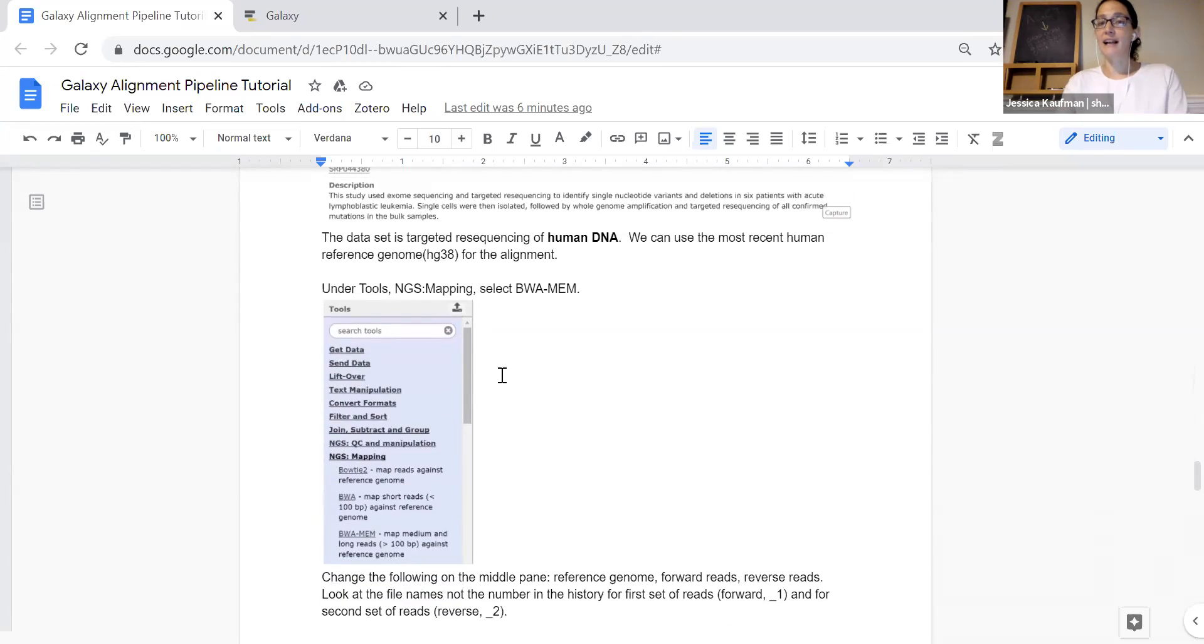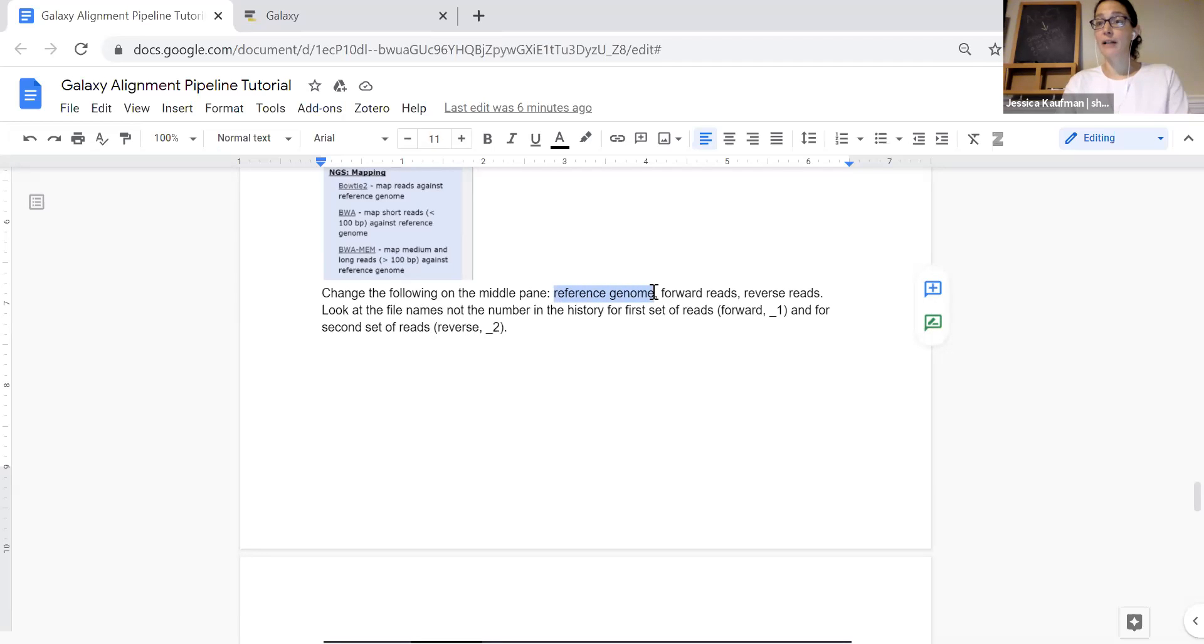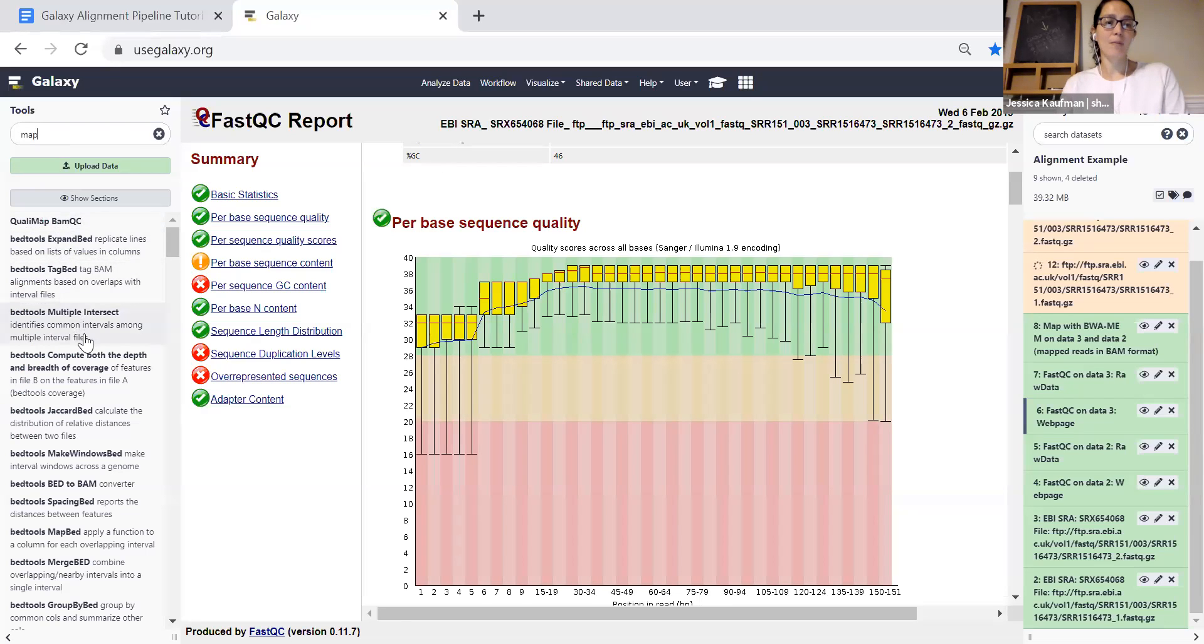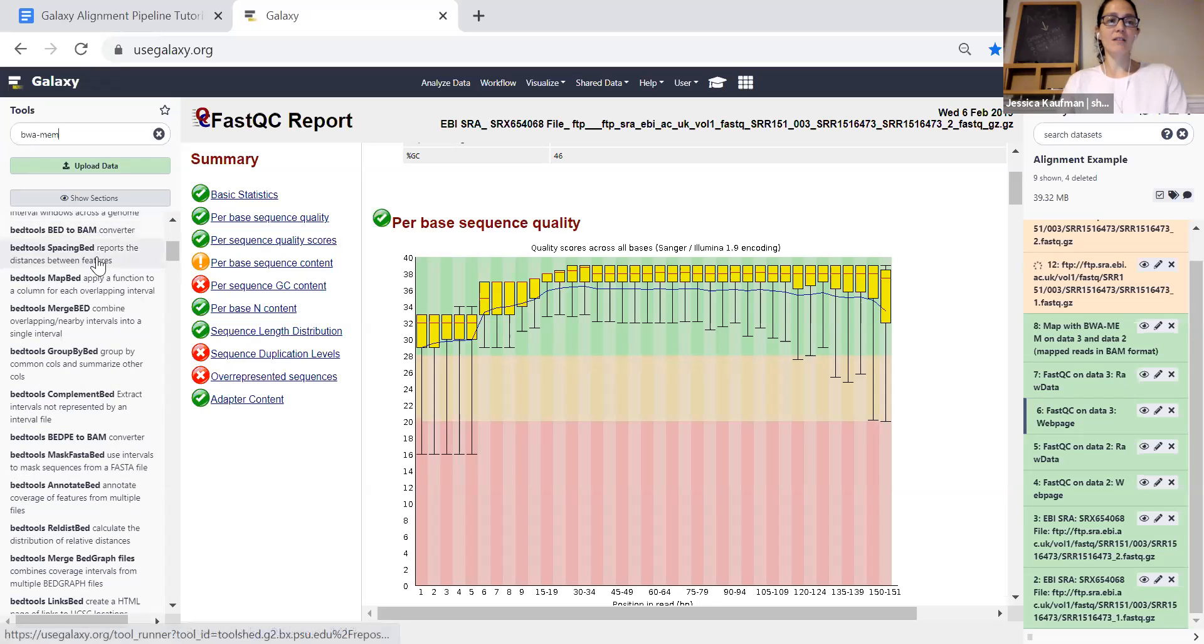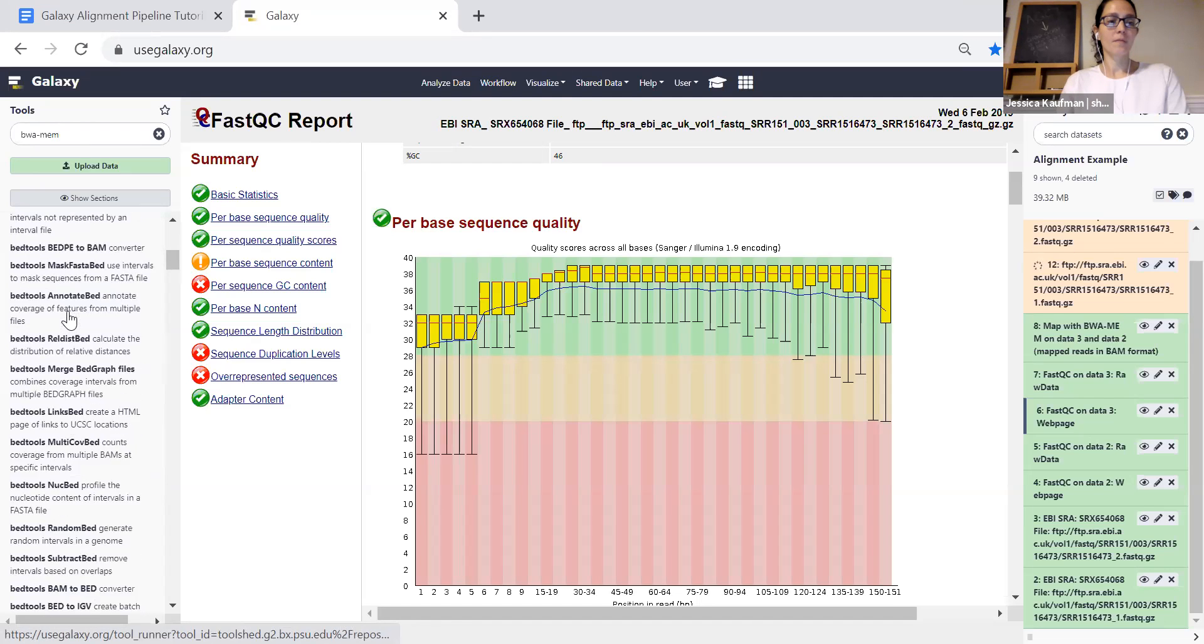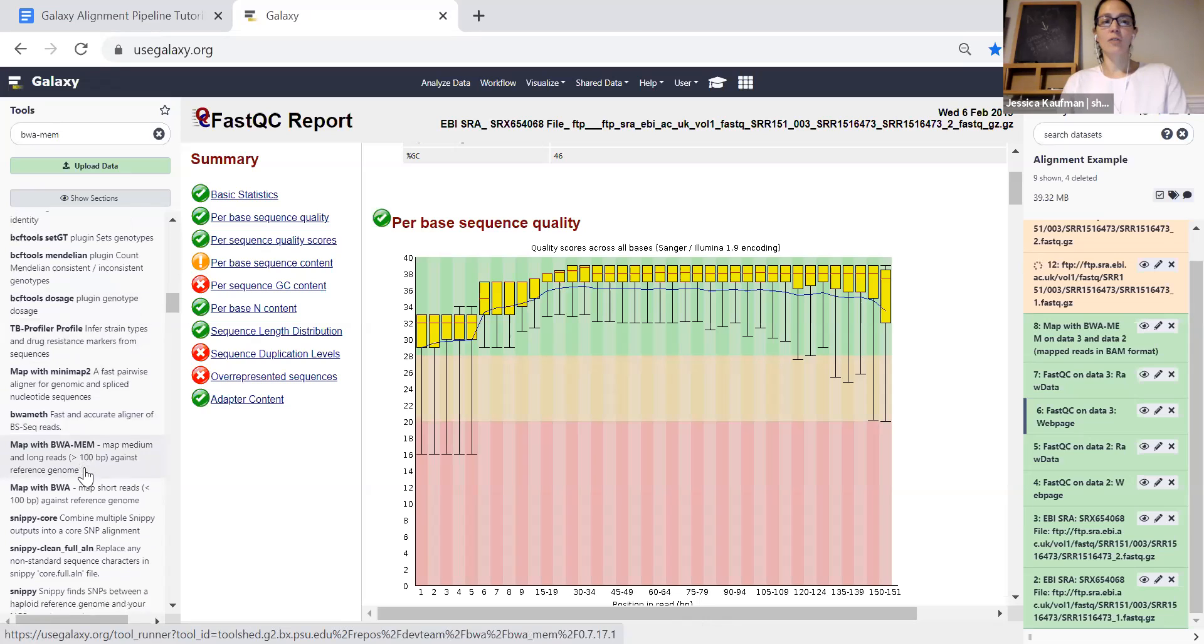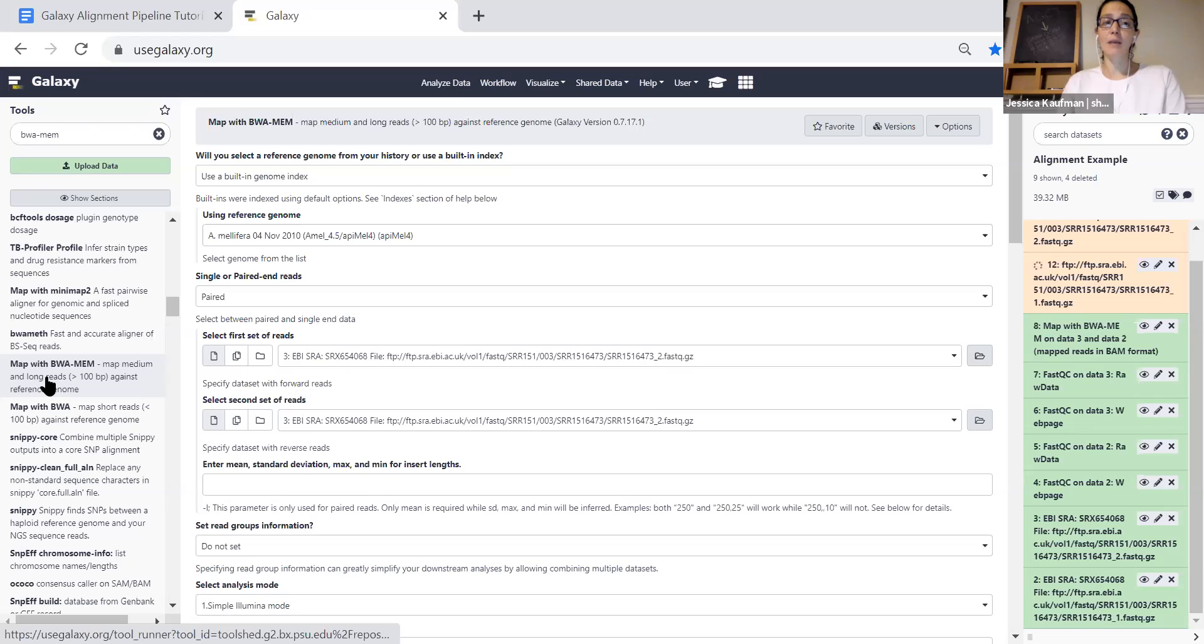We do this by selecting the BWMem tool and then we want to change three things in the BWMem tool. The reference genome we're going to make it the latest build of the human genome. What are the forward reads and what are the reversed reads? So I'll show you how to set that up. In tools we say map to get the map with BWMem tool. I can actually try searching BWMem to see if I get better results. And this is the tool that we're looking for, map with BWMem. We want to map medium and long reads because our reads in the FASTQ file are 150 base pairs. If we had shorter reads we would choose the map with BWA tool.